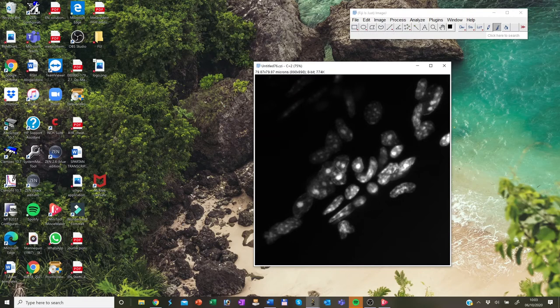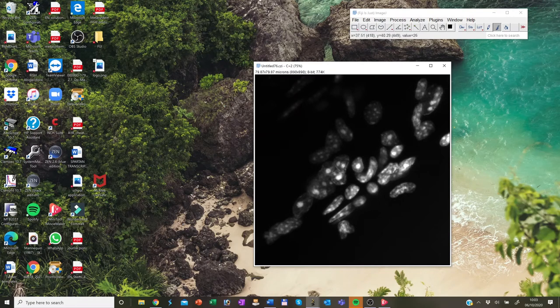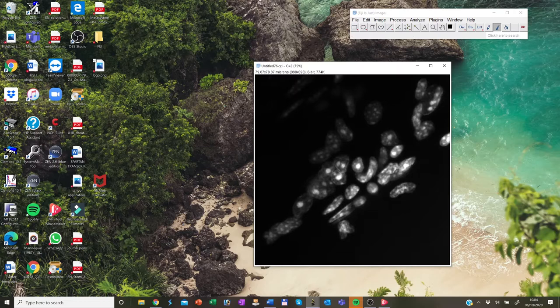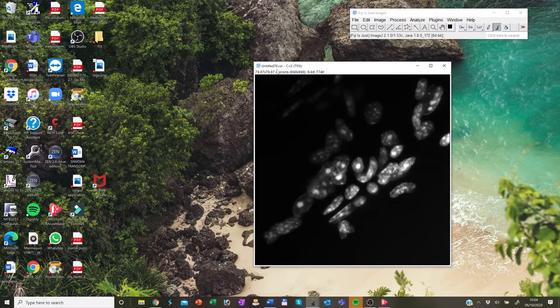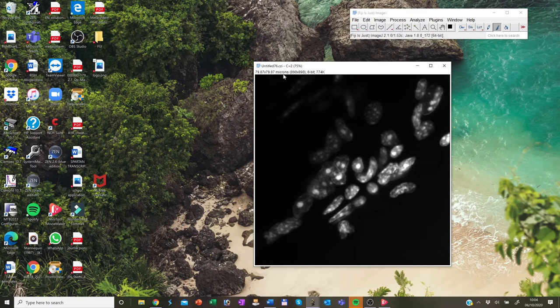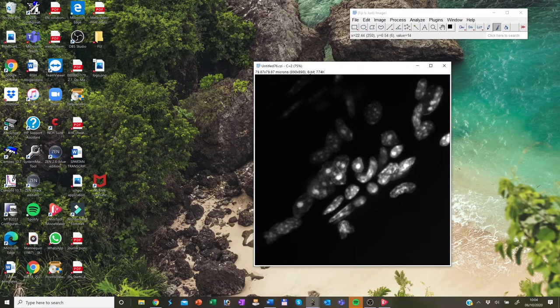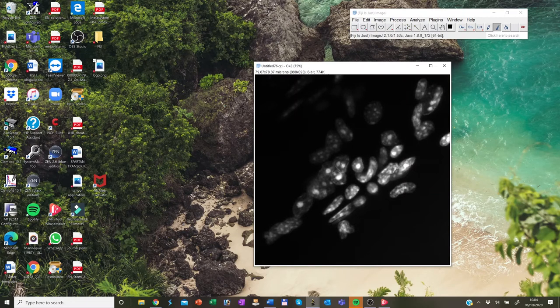And this is between 0 and 255 if it is an 8-bit image. And if you see, if you move the mouse, you see this value changing. Further information is displayed in the image window where you can see the real resolution if the scale bar is set. If not, then you see the pixel resolution, you see the image type and also the memory required by the image.